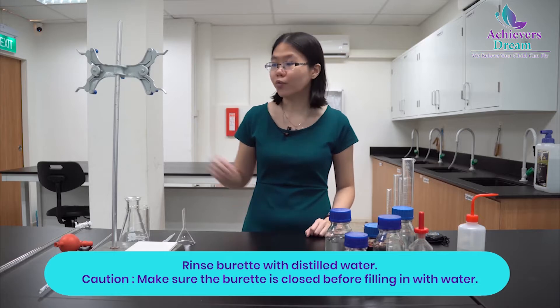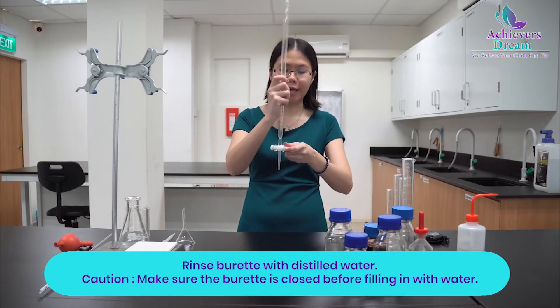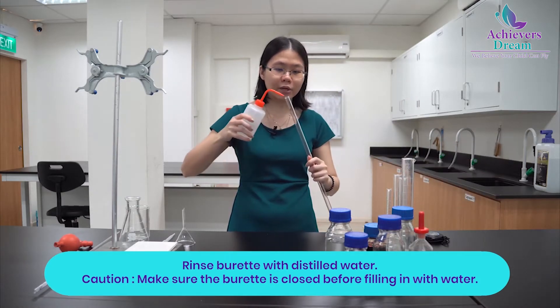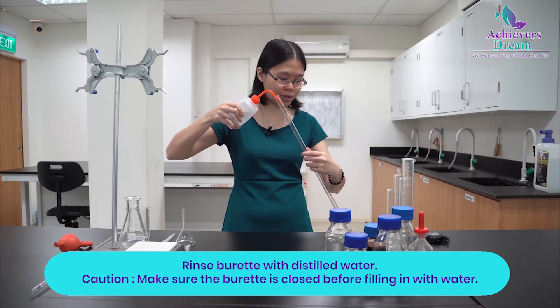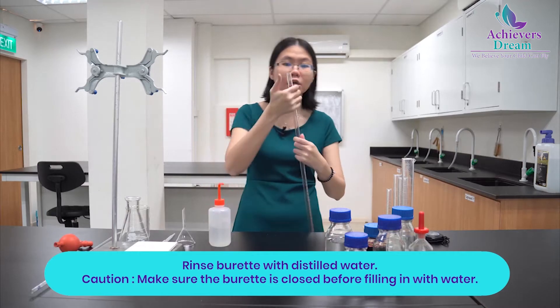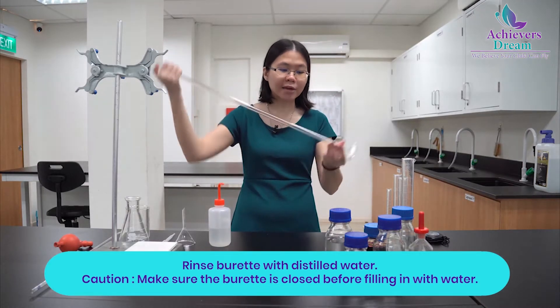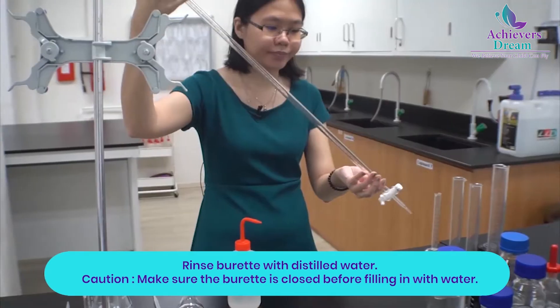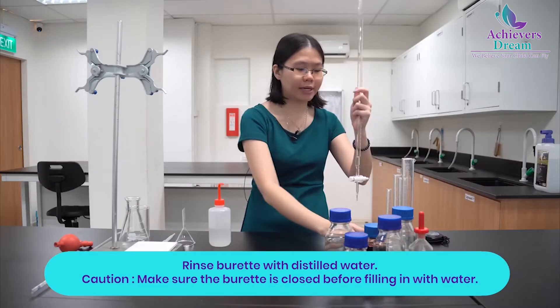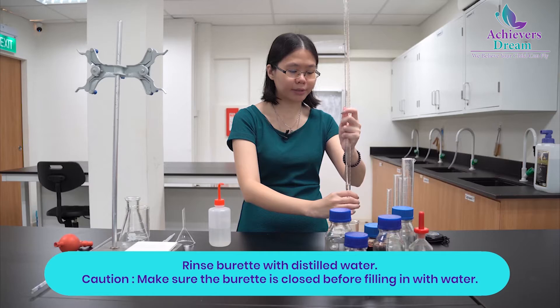Your first step is to rinse your burette with distilled water. Make sure that the burette is closed. Fill the burette with just a bit of distilled water, then cap the top of your burette and gently rock it side to side while rotating. Then drain the distilled water into a waste beaker.